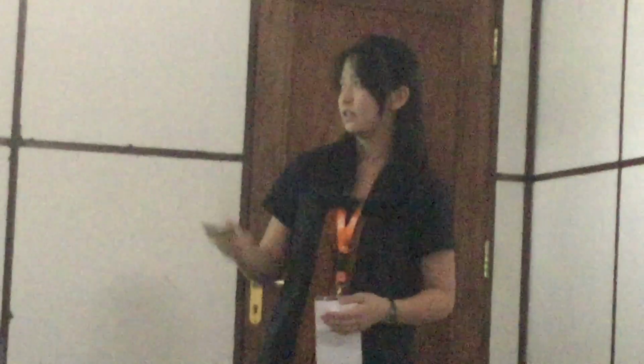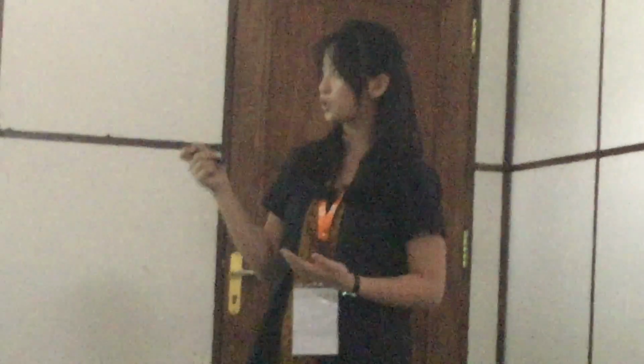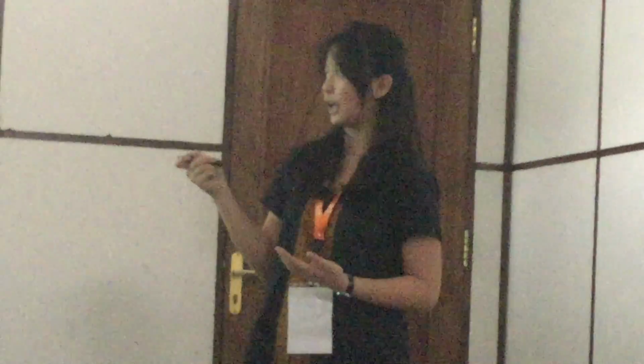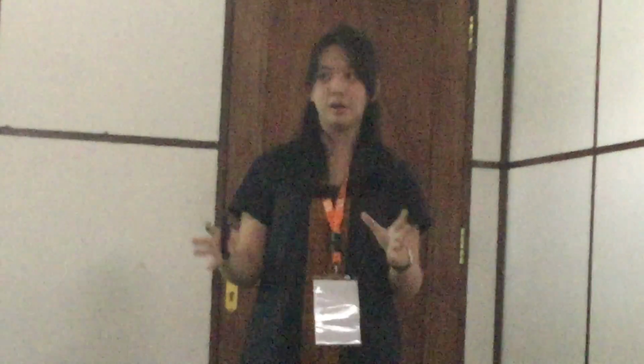So now we have seen the whole algorithm. Let's take a look at the running time proportions. The whole algorithm is divided into 6 steps, and we can see that the step that takes the most time is the clump splitting right here. This is due to the number of clumps that are being split in one image.